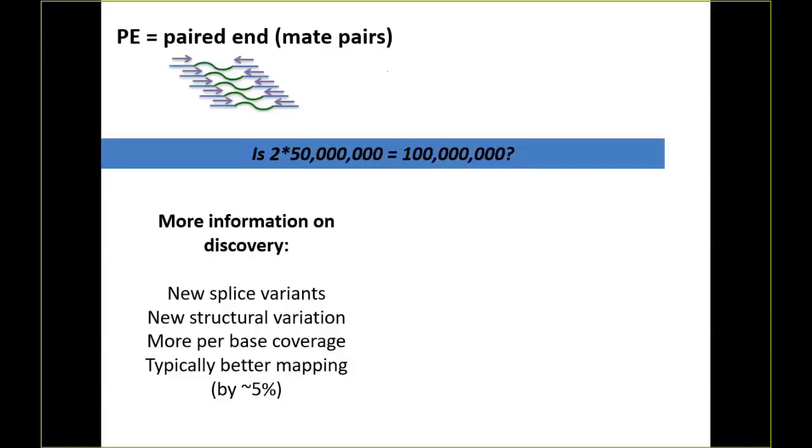If I'm looking for structural variation, so insertions or deletions, or inversions or that kind of thing, if I sequence paired end 1, and that comes from chromosome 1, and I sequence paired end 2, and that comes from chromosome 20, what am I probably looking at here? Okay, I heard somebody say translocation. That's pretty likely translocation, especially if I keep seeing reads where paired end 1 is chromosome 1, read 2 is chromosome 20. There's a translocation there.